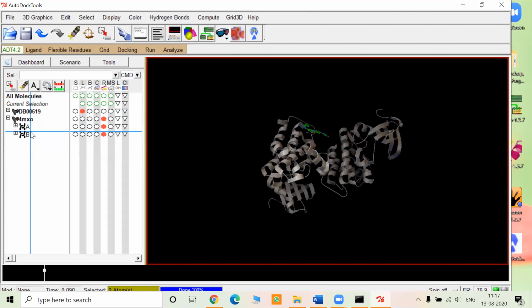Now, why did they put an inhibitor already and save these structures for study in X-ray diffraction? Because it keeps the binding site of the protein molecule in a stable conformation, so that anybody taking that molecule from the database center can remove the pre-existing inhibitor and put their molecule of interest into it. So the structure you're taking is already in a stable conformation, and it becomes easy for you to understand the interaction of your new ligand with the active site of the enzyme molecule. Okay, so that is one point.